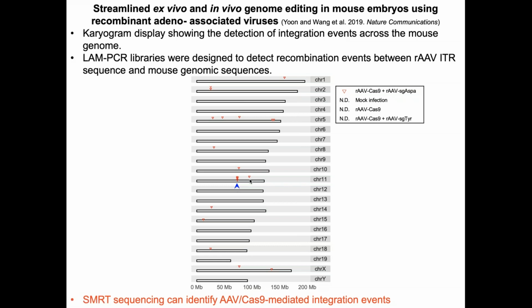And so this type of methodology not only shows us the ability to pinpoint where the off-target integration events are, but also on-target integration events. And of course, again, this may highlight the limitations of the approach, but we really like to see this as advancing our capability of detecting these events so that we can develop new platforms that have improved safety profiles, right? So those vector strategies that of course limit off-target integration as well as on-target integration.